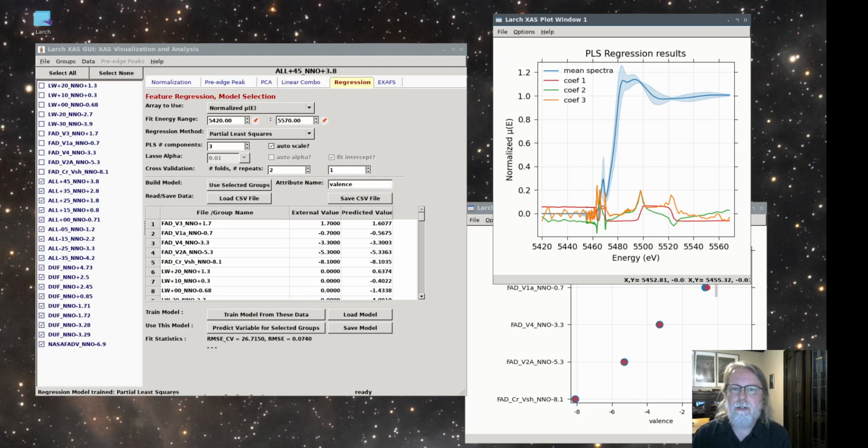You'll also need to do the machine learning, we'll also need to interpolate the data onto a common array of energy points. That's easy to do, and so is automatically done here. You don't need to do that yourself if you are importing data into this. Anyway, so let's continue. I'll just predict the rest of these, and let's see how it works.